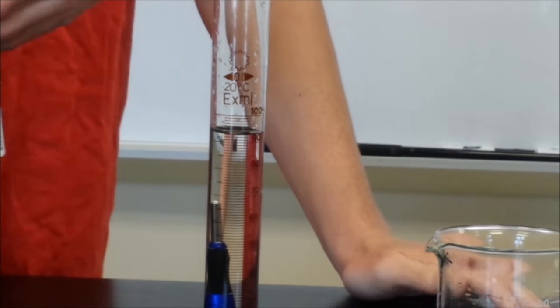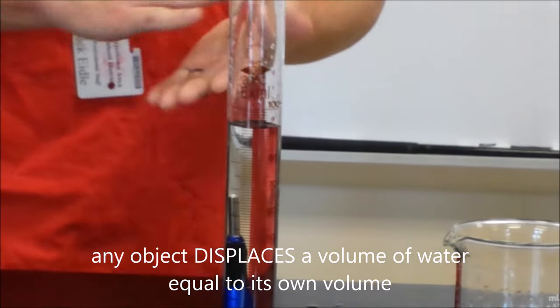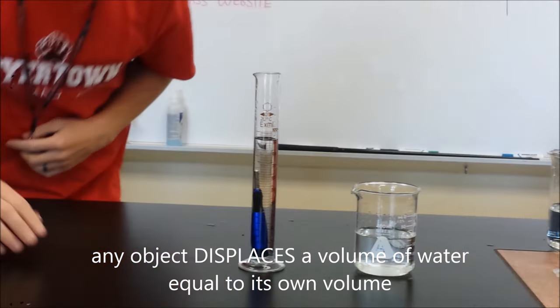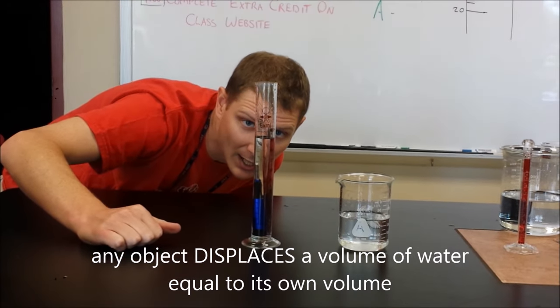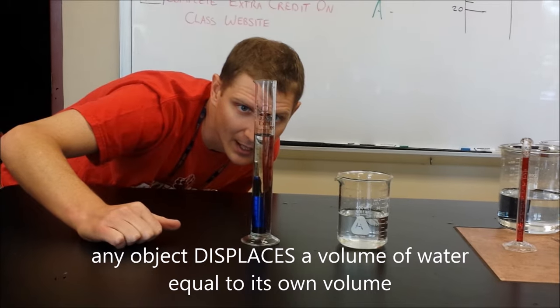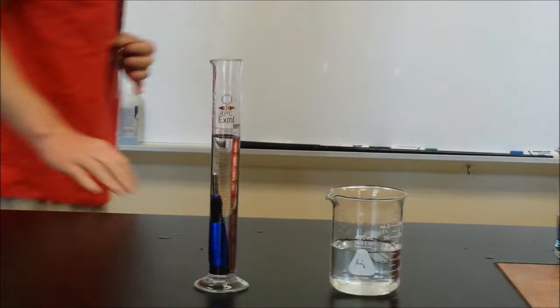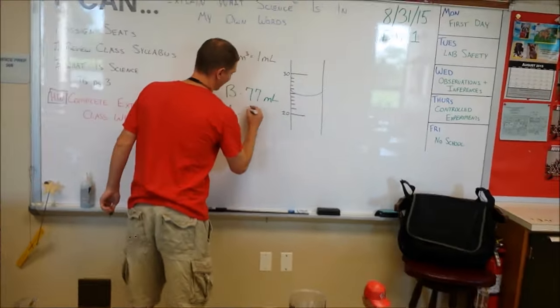So now we're going to take our after reading. Again, you want to get down eye level with it, you want to read the bottom of the meniscus. So if I get down eye level with this, and I'm reading the bottom of the meniscus, it looks to be about 92 milliliters. That's our after.